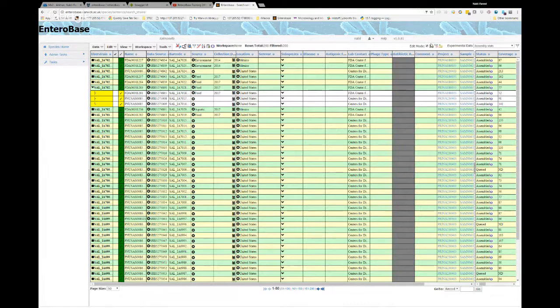To confirm it finally, there's a button up here, upload changes. Now I don't want to upload these changes because they don't mean anything, but if you press that, it'll send them off and give you a notification that it's fine. Now, as a user, you can do it on your own data that you've uploaded or that your buddies have uploaded. You can't do it for random public data like these records on this page, unless you are a curator of the database.